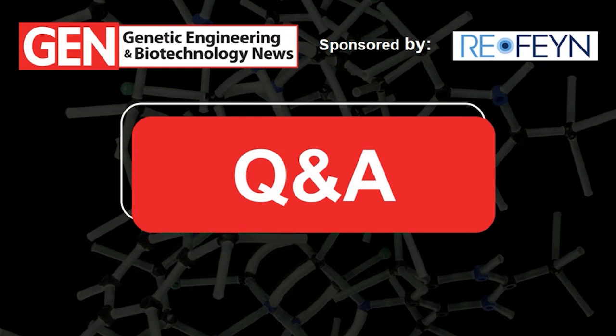All right, thank you for that, Svea. Next question, how often do you need to calibrate the system, and what calibrant is used? So the calibrant used, as I mentioned earlier, that is a bit up to you. It should be something that you know the mass of, and it's in the range of the measurement of the machine. Typically it's thyroglobulin and AAV. And we recommend to calibrate at least once a day. So whenever something changes, such as the temperature, it's really important that you recalibrate. And also a fresh calibration is especially important if you want to precisely measure the mass. So, the recommendation is at least once a day.